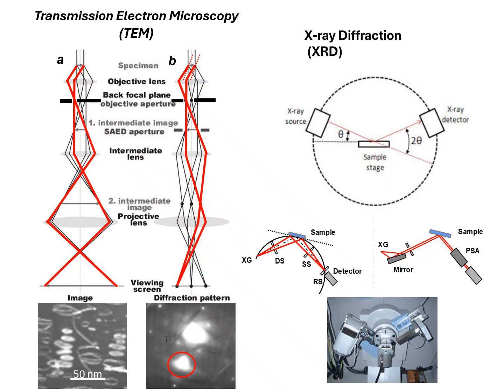reflection. For comparison, we've got X-ray diffraction. X-ray diffraction is very different from TEM because there's a weak interaction between the X-rays and matter, and essentially diffraction amounts to scattering, where you get constructive interference of the scattered waves, whereas in TEM, the diffracted waves that have strong constructive interference can be diffracted, scattered, and rediffracted many times as they pass through the material.